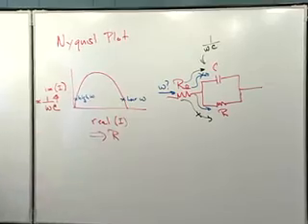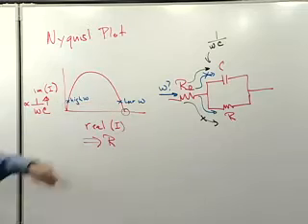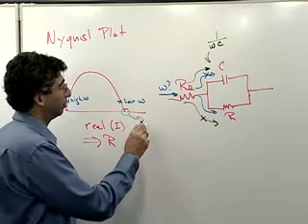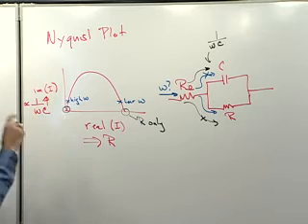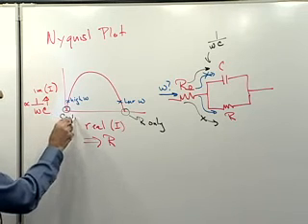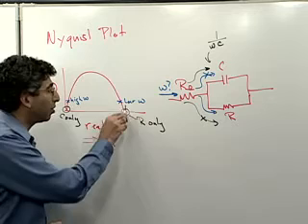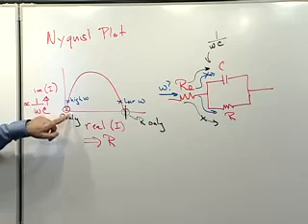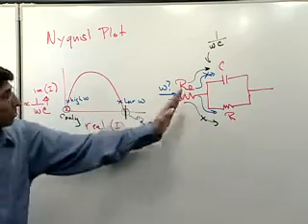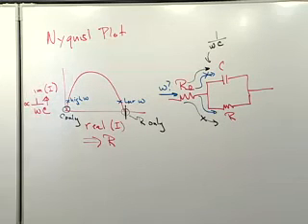So at this end, right here, 0 frequency, everything's going through the resistor. And then as I go to higher and higher frequency, I get to a point where everything's going through the capacitor. All the current's here. So when I measure this point, I'm measuring the resistance of this circuit. And when I'm measuring this point over here, there is no resistance from the resistor because everything's going through this upper branch, and I'm looking at the capacitance of the system.